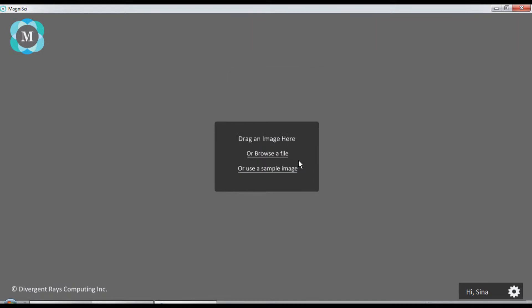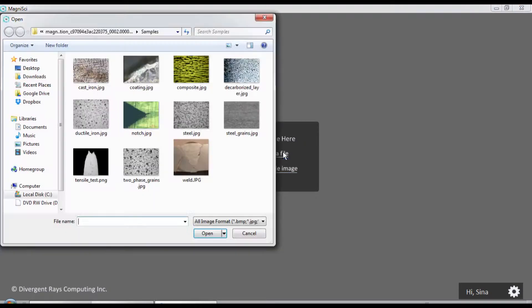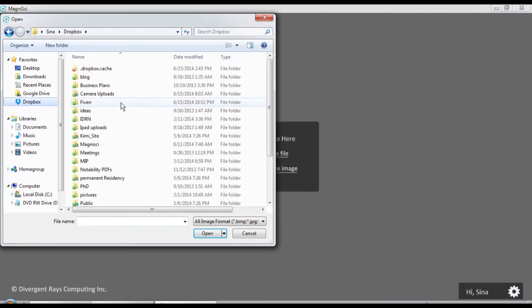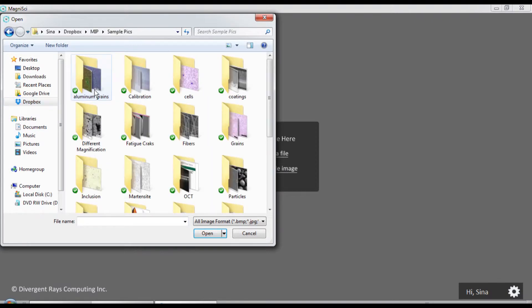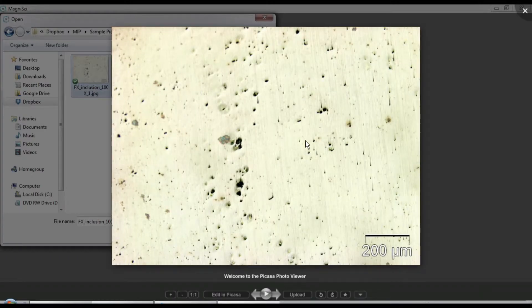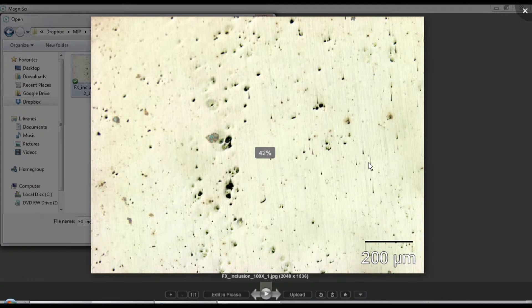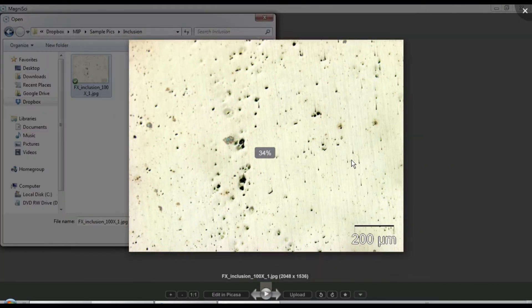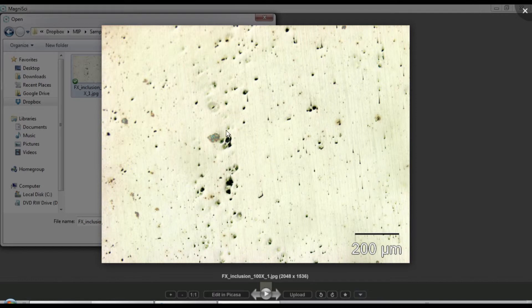Hello and welcome to the Magnesi software. Today I would like to show you how to do a measurement of a sample with inclusions. The sample image has particles inside with defects from sample preparation - in the ideal case the inclusions are totally circular, but we see this kind of artifact because of the polishing. The goal here is to measure the number density of the particles or inclusions in this sample.